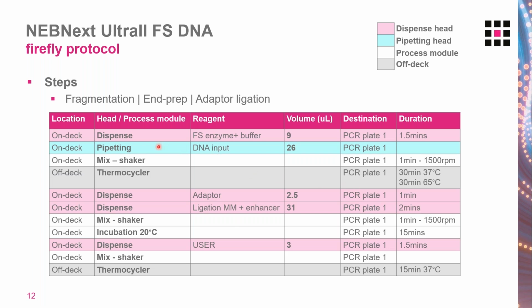The pipetting head was used for the plate transfer from the DNA input plate to the reaction plate. And we've used shaker mixing where possible to minimize tip consumption. And we've got a thermal incubation here on deck. The last part of this protocol is the movement of the plate to the thermocycler for this USER incubation.